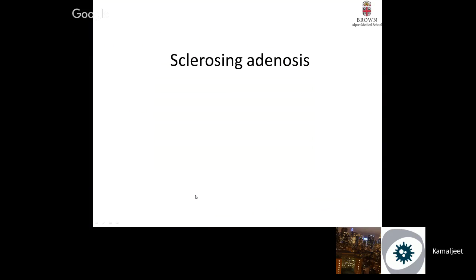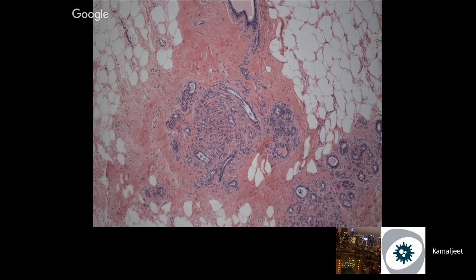So, moving on from fibroepithelial lesions, sclerosing adenosis. I got this also as a topic. Most of the time it's an incidental finding. And the central part of it, it's a TDLU-based lesion. So one entire TDLU will undergo sclerosing adenosis.